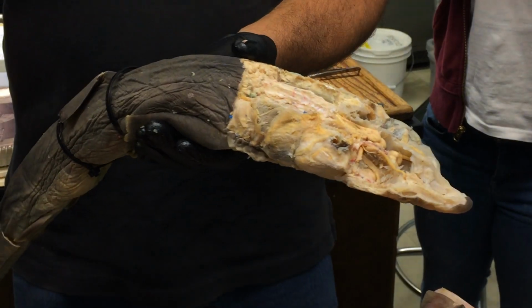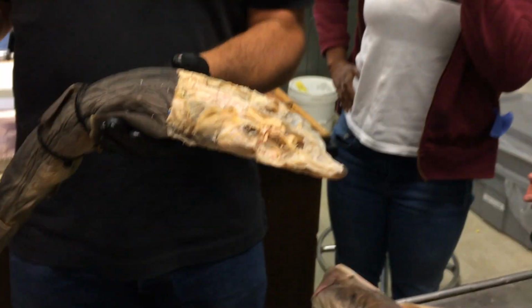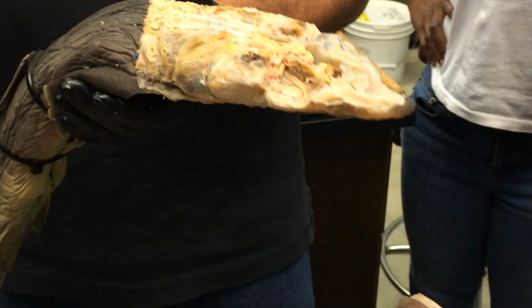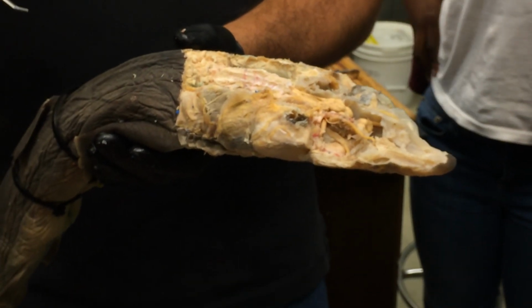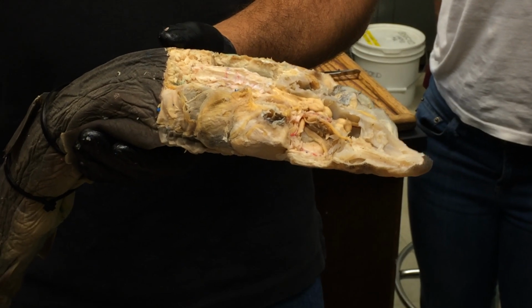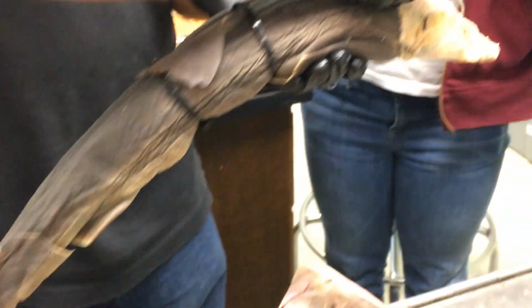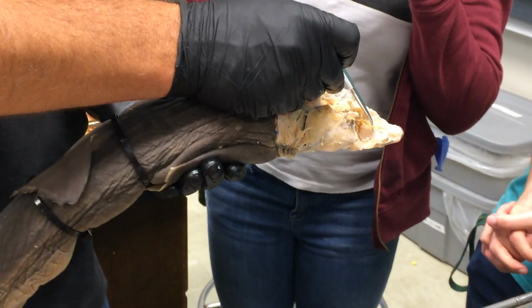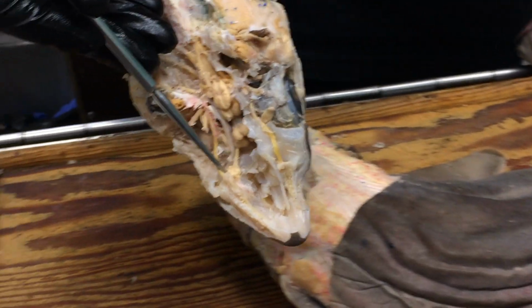But remember, there's 5 general regions of the brain: the telencephalon, diencephalon, mesencephalon, metencephalon, and myelencephalon. And that's from front to back. The telencephalon consists in the shark of the olfactory bulbs, olfactory tract, and cerebral hemispheres. So this is the olfactory bulb here. And the olfactory bulb is plastered right up against the back of the olfactory sac. So this is actually part of the brain, not part of the nose.